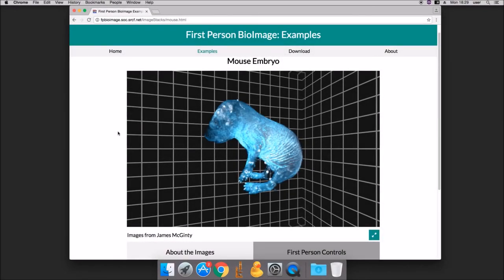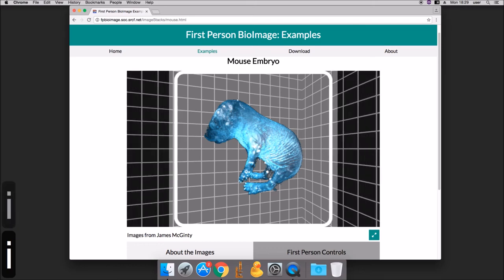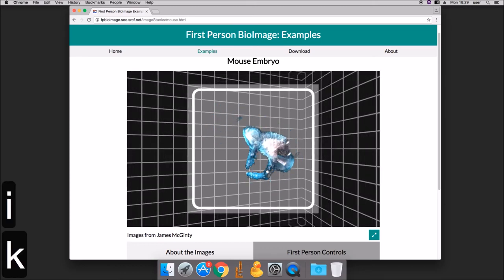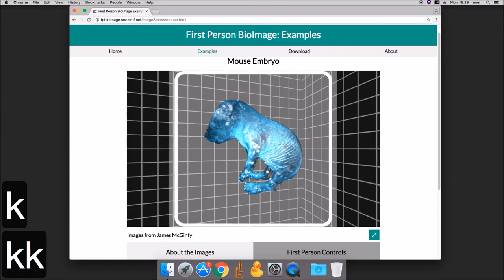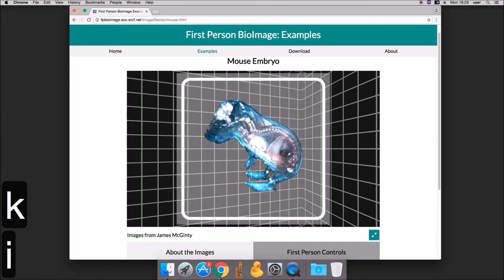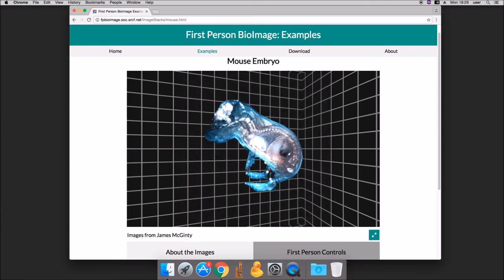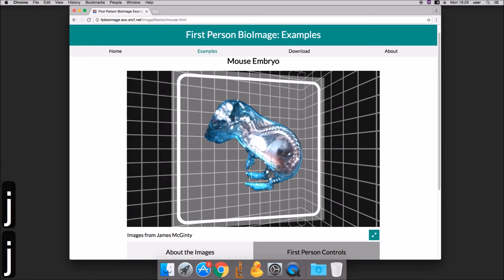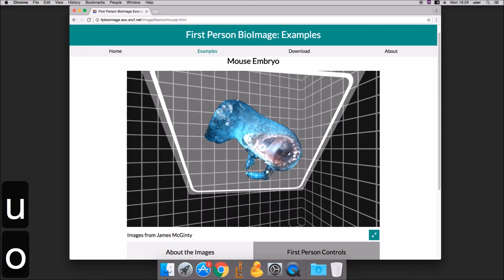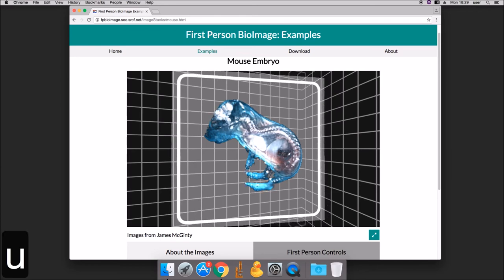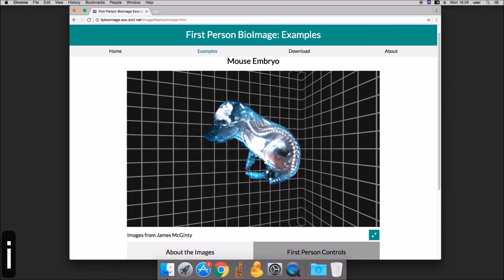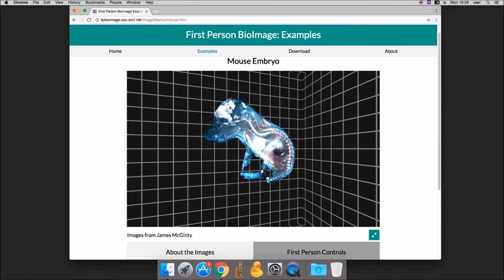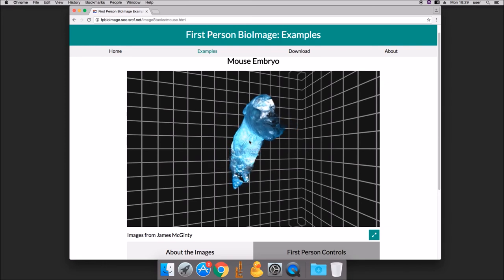FP BioImage provides a clipping plane to cut the 3D data open. I and K move the clipping plane forwards and backwards. J and L rotate it about its axis, and U and O tilt it backwards and forwards. When you've found a cut you're satisfied with, press X to freeze it to the model. You can then rotate the model with the cut attached to it.